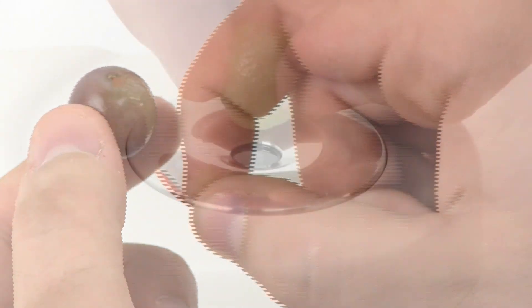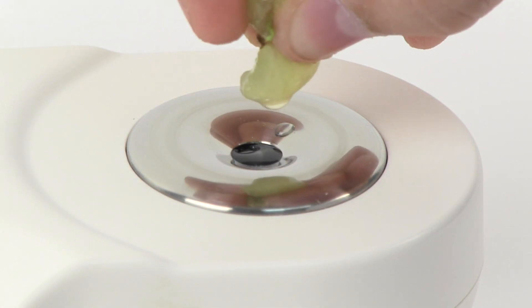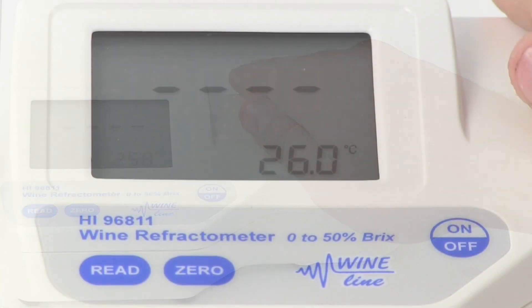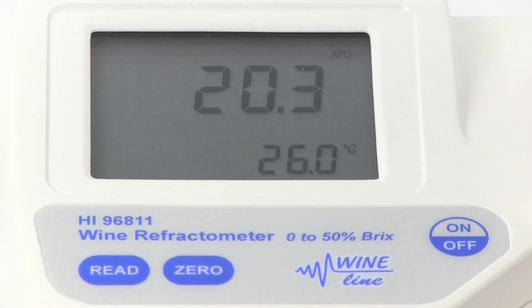First, we skin the grape. Then, the juice is squeezed from the grape onto the sample well, ensuring that the prism is completely covered. Then, we cover the prism with our hand and press the read key. The measurement is directly displayed. The measurement of this grape is 20.3 degrees Brix.